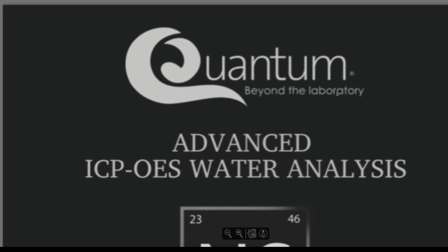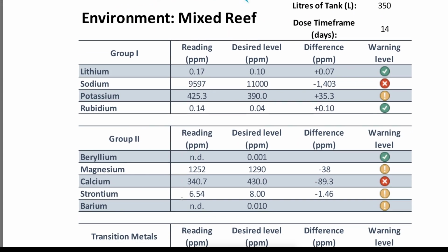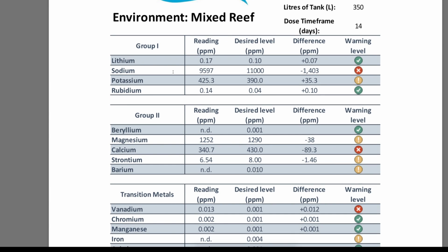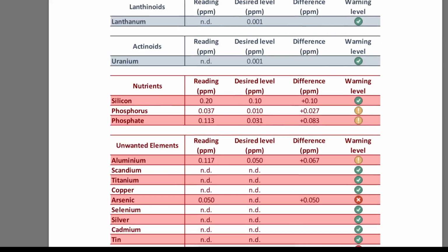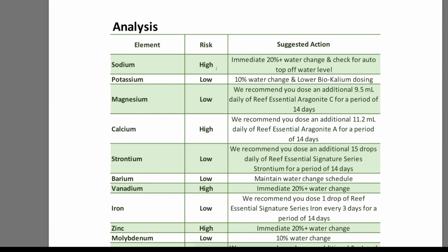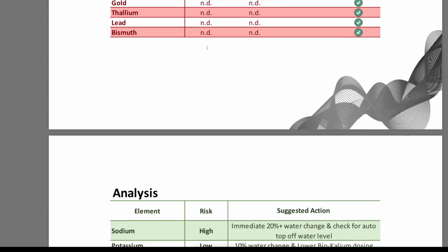you get a PDF, this nice opening screen, and then it follows a similar path. I might see if I can get that to zoom out a little bit. Where you get your element, what the result is, whether that's a tick across or a slight warning. Then down the bottom, we also get some instructions for the things that came up as high or low or warnings, what they recommend to change. You also get RODI results here, but we'll cover that in a second.